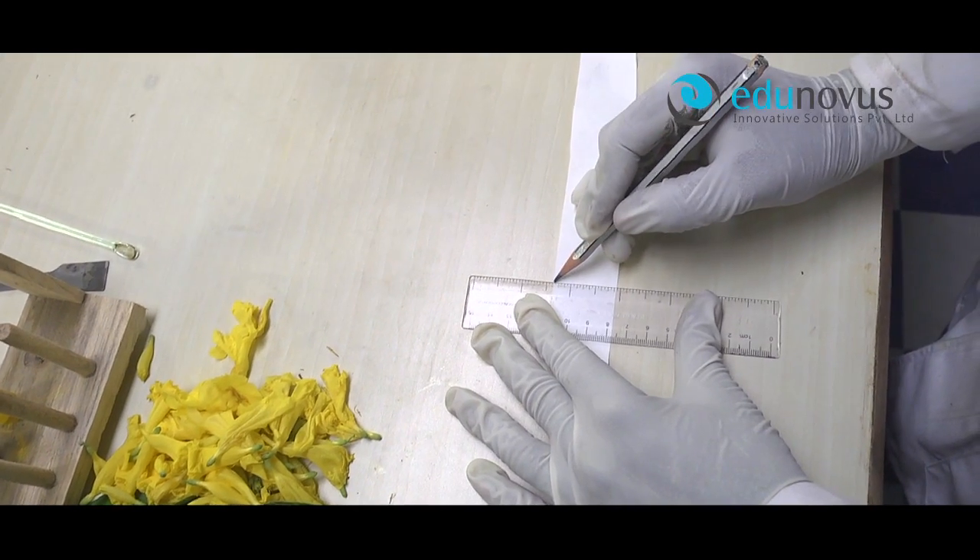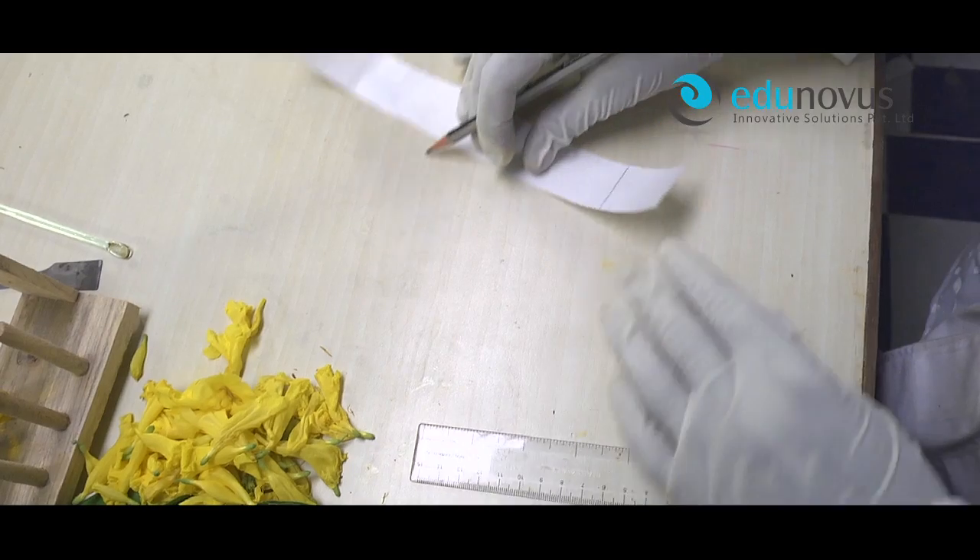Take a Whatman filter paper strip and draw a line with a pencil about 4 cm from one end.